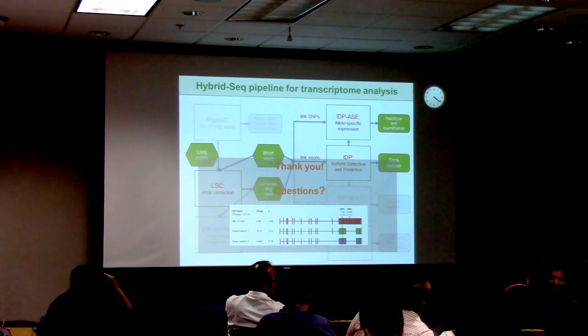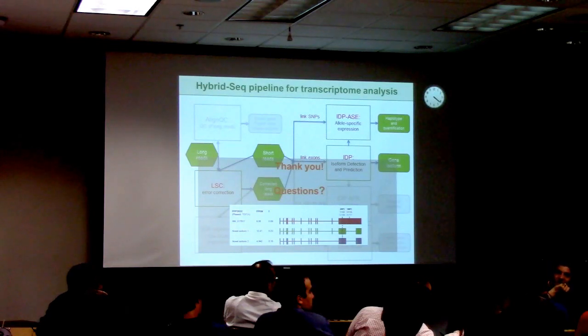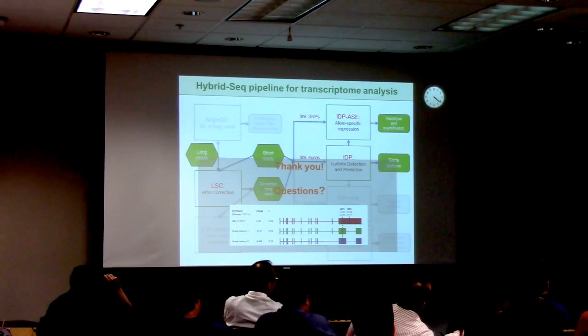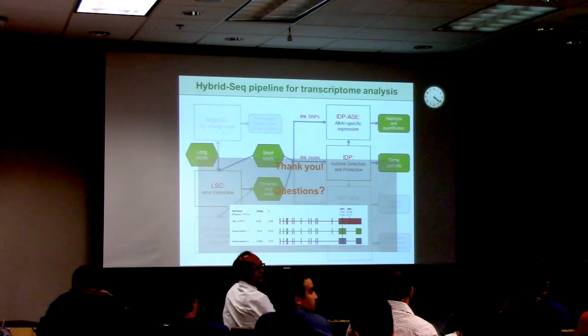So, these novel transcripts that you found, where was it, in the stem cells? Yeah, stem cell. You had said that some of them were 95% repetitive elements. By repetitive element, do you mean high copy repeats, or do you mean pseudogenes, where it's a recent segmental duplication? That's a very good question. Well, we just check the UCSC tracks, where you have a definition of multiply mappable regions, the mappability of regions. Once the mappability is smaller than 1, we call it repetitive.